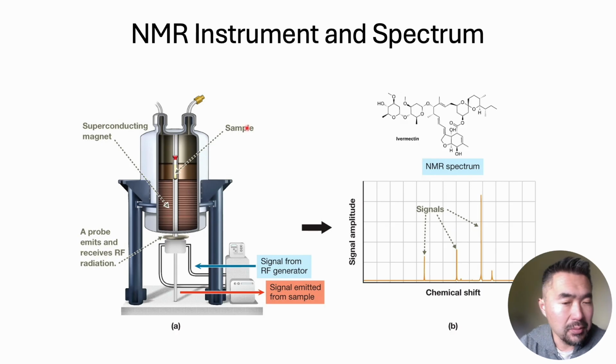Okay, so NMR spectroscopy is done in an NMR instrument that looks something like this. Usually if you walk up to it, the more impressive part is the big magnet, which often is a superconducting magnet, which means it needs to be cooled to almost absolute zero temperature. So there's a ton of liquid helium and liquid nitrogen to cool that, so it's pretty big. That's the impressive part. The expensive part actually is the big computer next door that processes all the signals.